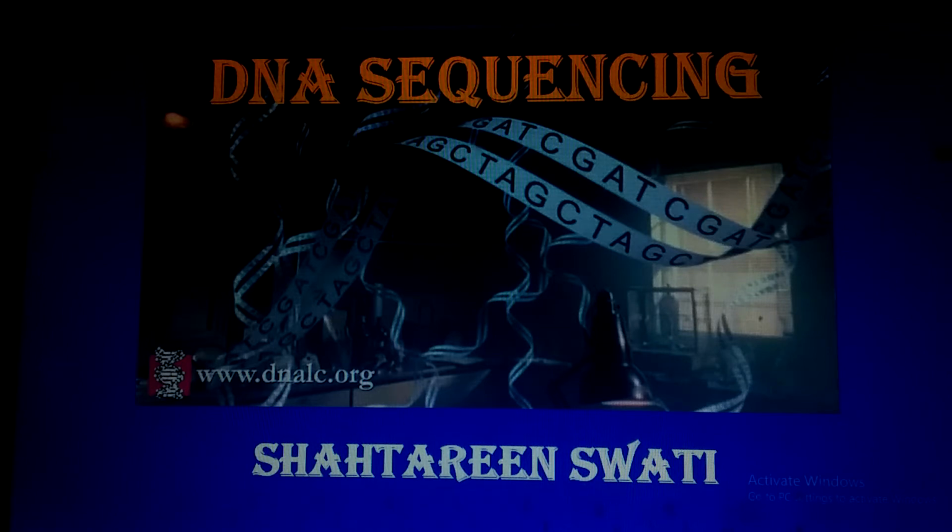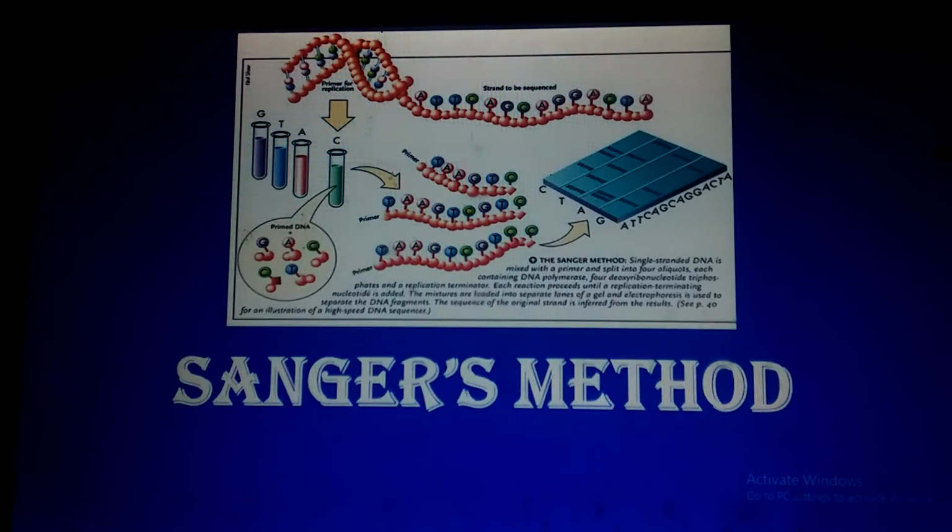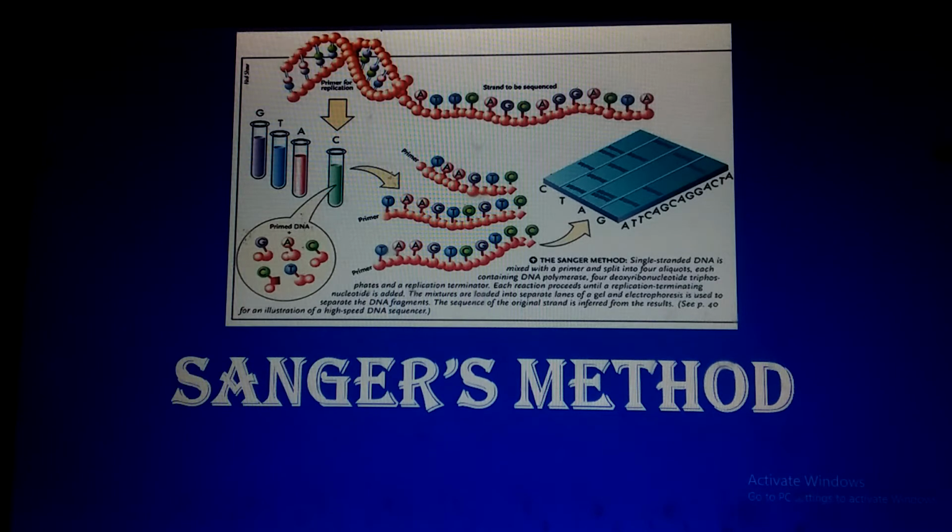About DNA sequencing, and I will continue from my first lecture where I left yesterday, where I discussed in detail the basic concept and basic principle of DNA sequencing, and a little bit about the Sanger method, the history of the Sanger method, and all related material and dNTPs and many more. So today I am starting my lecture where I left yesterday.